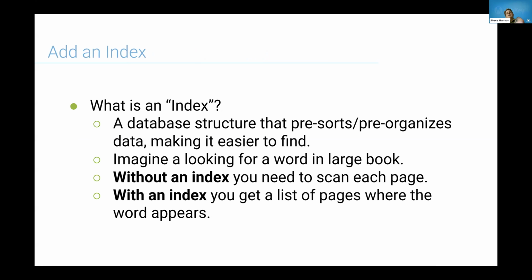So second, let's talk about adding an index to a field. So what is an index? Well, it's a kind of database structure or database device that pre-sorts or pre-organizes the data, making it easier to find.